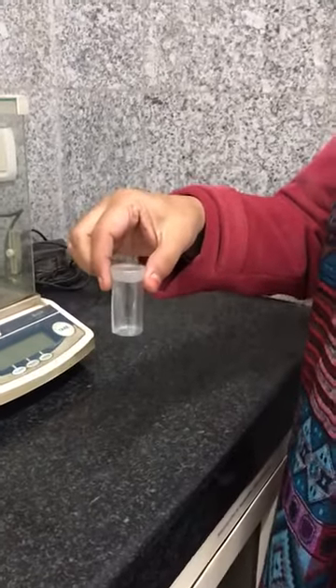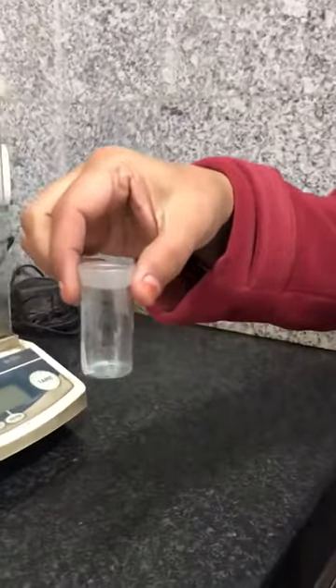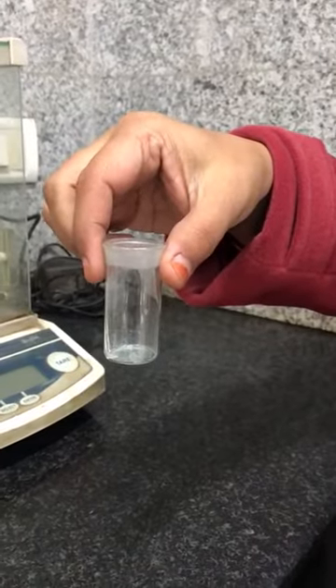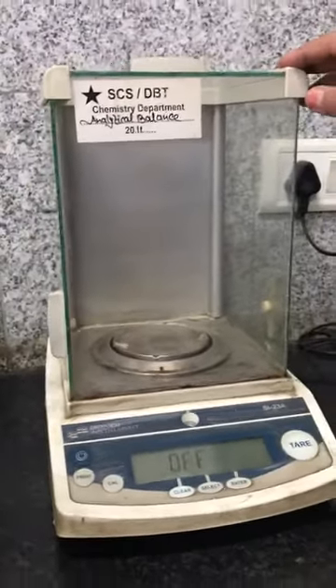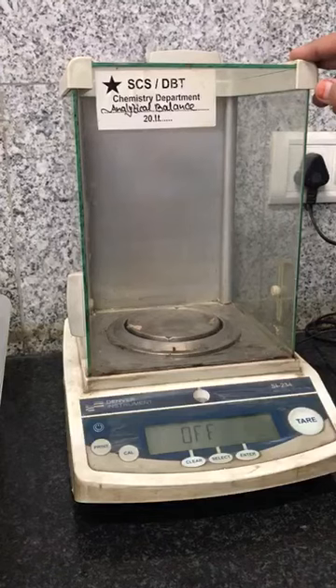This is a weighing bottle which you will be using for weighing any of the substances. This is a weighing balance which you will be using for weighing any substances for making any standard solution.